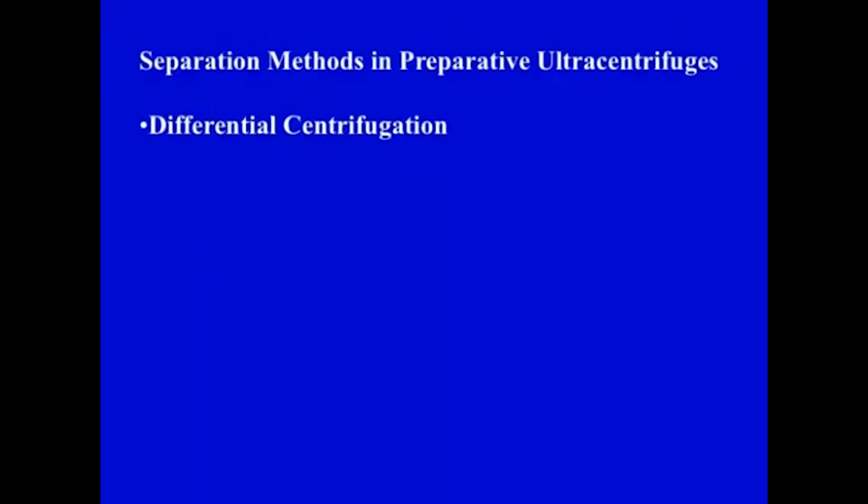Now, in this lecture, we are going to discuss the separation methods which are based on preparative ultracentrifuges, and you can say these are preparative methods where you are aiming to get the material for further biochemical investigation.